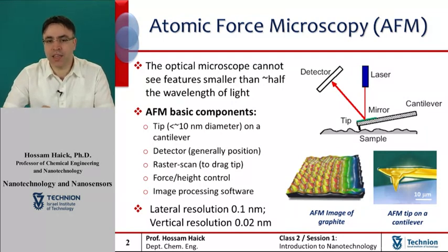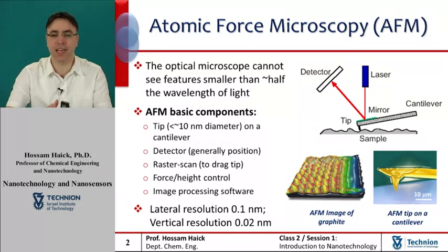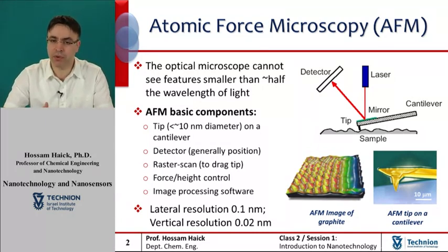The information in the AFM is gathered by feeling the surface with a mechanical probe. In this context, piezoelectric elements that facilitate accurate and precise tiny movements enable the very precise scanning of the surface. In some variations, electric potentials can also be scanned using conducting cantilevers.